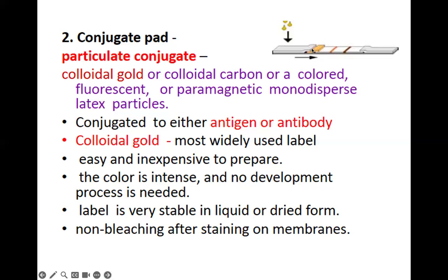So the optimum, based on our experience, but you may ask Dr. Hafiz and Dr. Ain tomorrow, theoretically, should be not more than 1 milligram per liter.